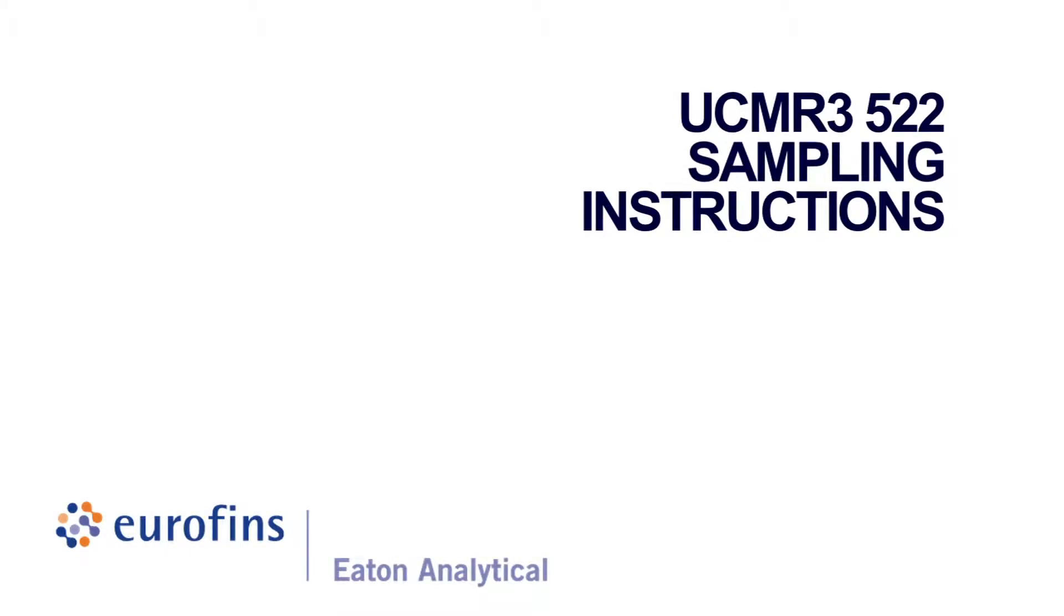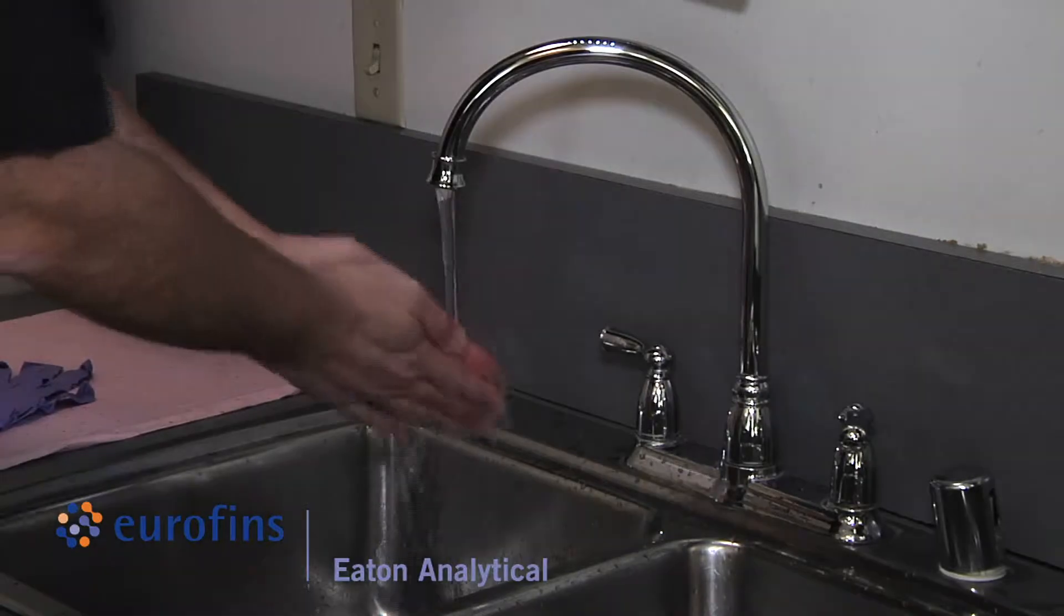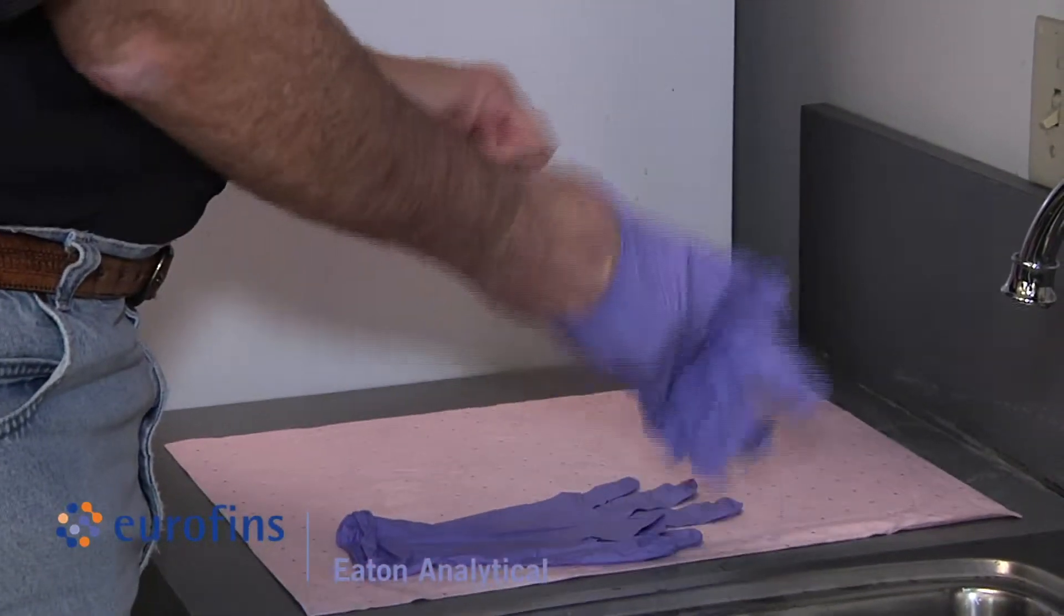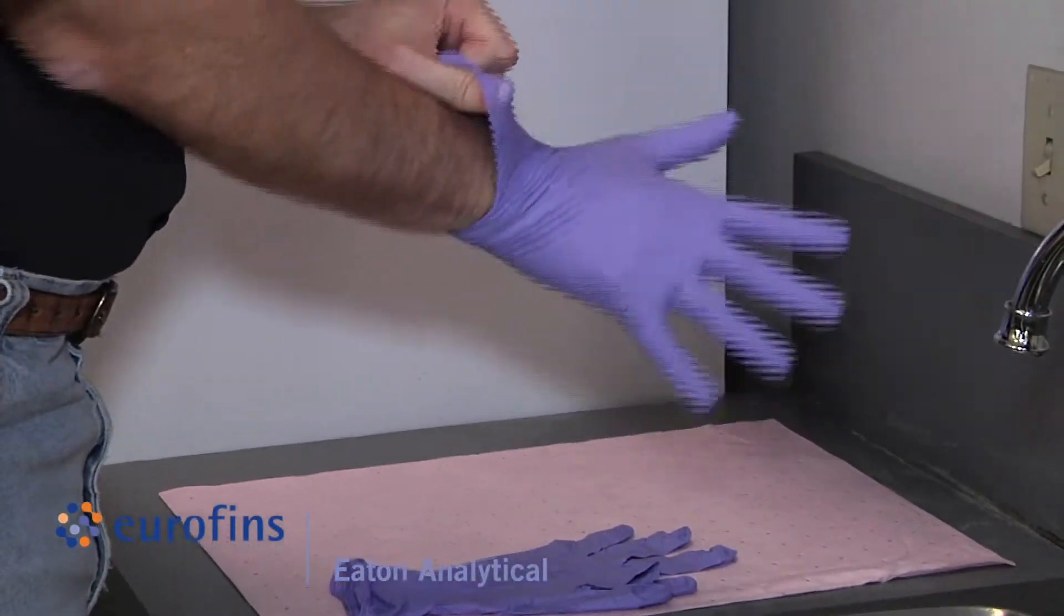UCMR 3 522 sampling instructions. Wash your hands before sampling and wear the powderless nitrile gloves which are included in the kit during sampling and sample handling.